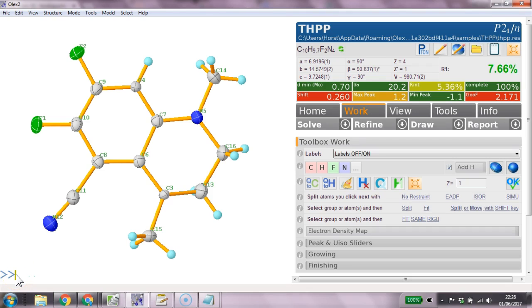Hello. In this video I would like to show you how to solve and refine this structure THPP that's shipped with OLEX2 without the mouse.